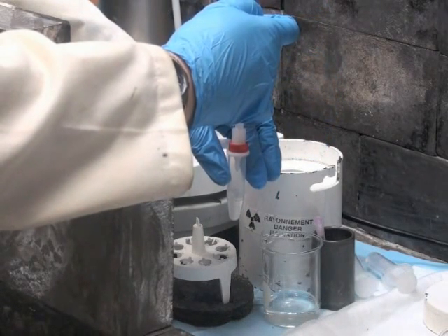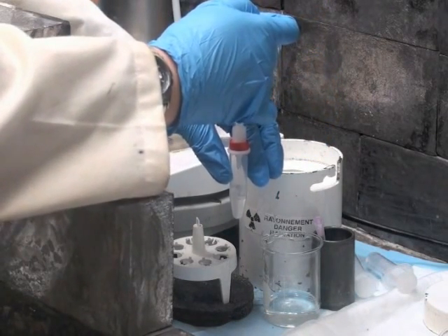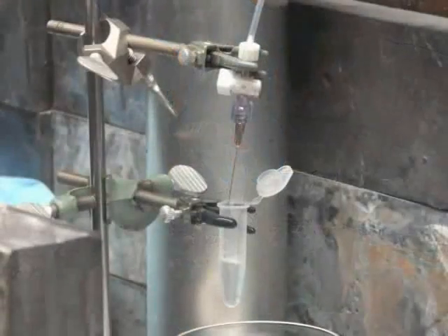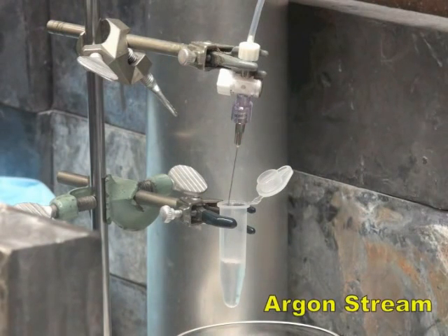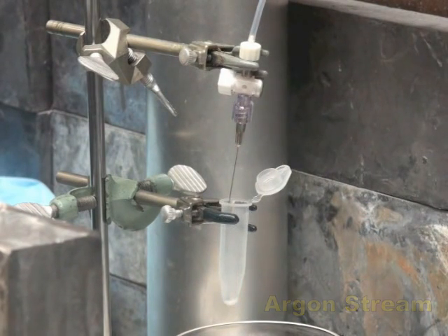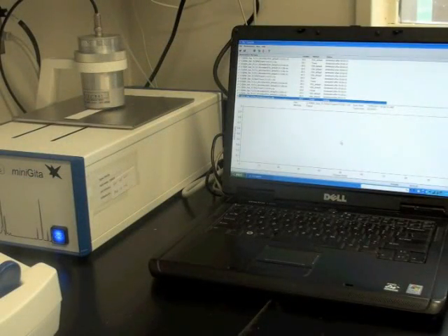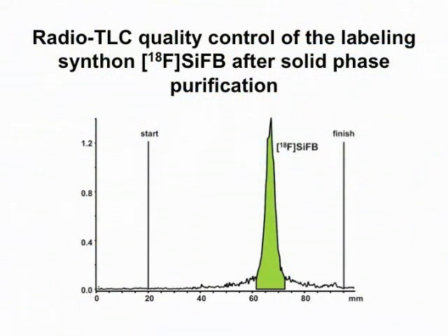Elute the fluorine-18 labeled SIFB from the cartridge with diethyl ether. Evaporate the diethyl ether under a stream of argon. Use radio thin layer chromatography to confirm that the radiochemical purity is greater than 98%.